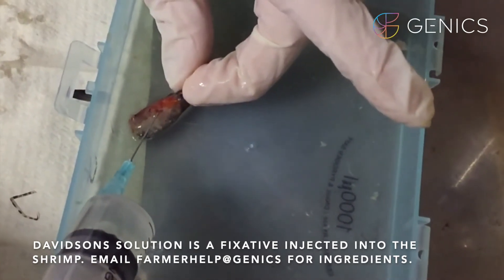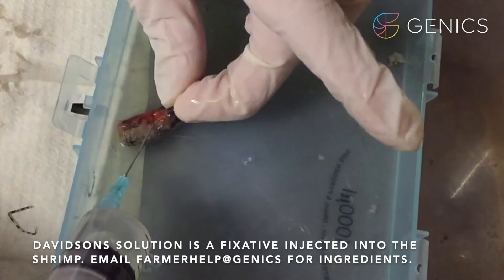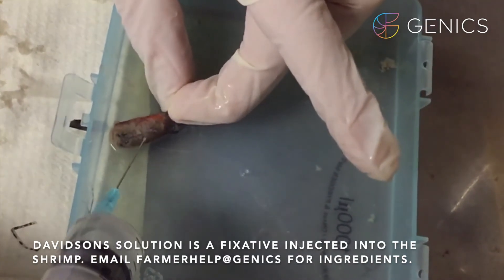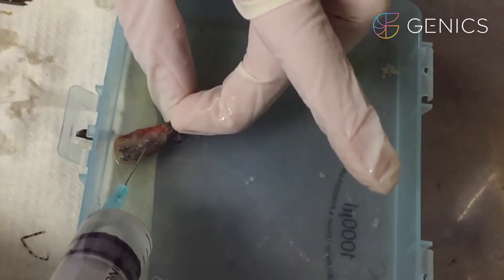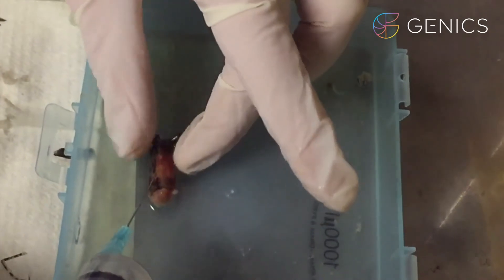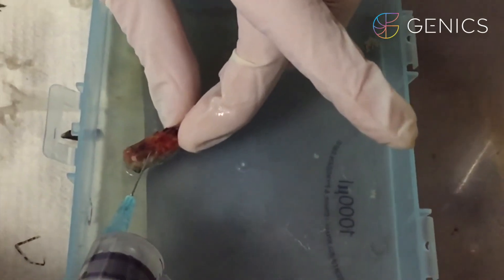We then inject Davidson's solution in through the periopod area and the mouth area, and up around the heart.